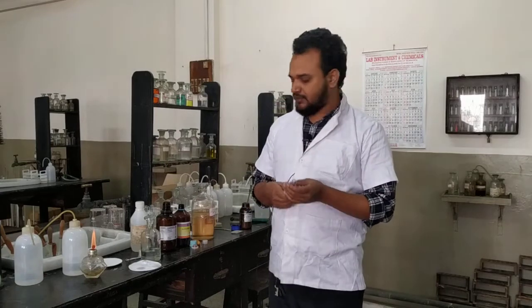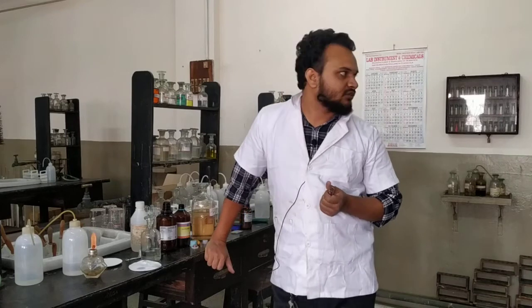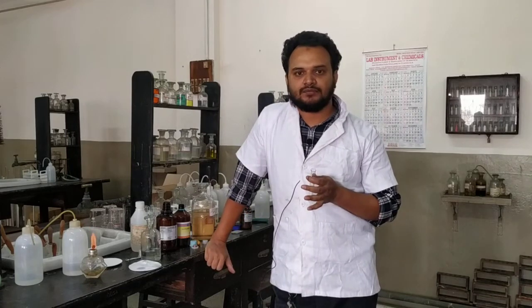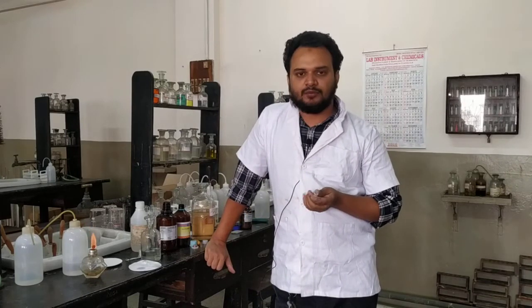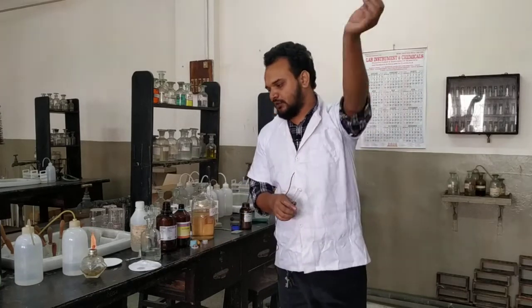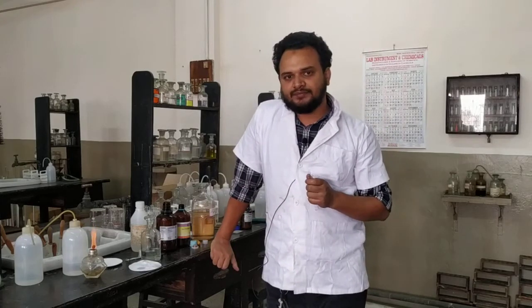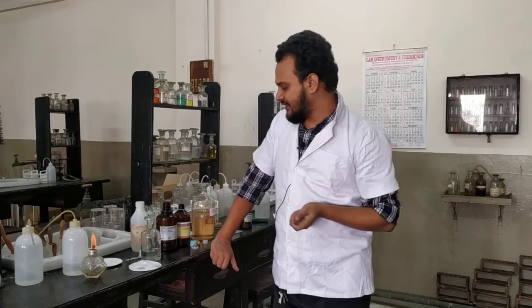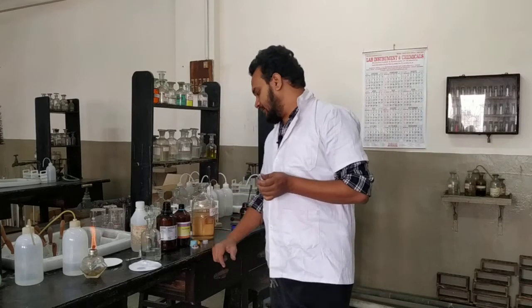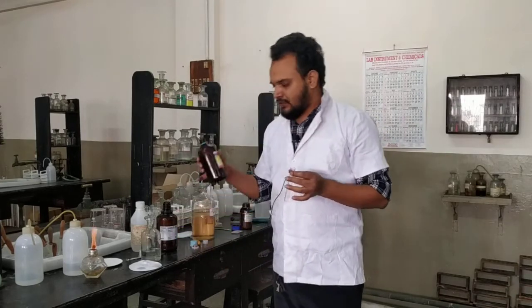Our next test for glycerol is the phenol test. We will add some crystals of phenol to glycerol, then some drops of H₂SO₄, warm it, and then dilute it with ammonium hydroxide solution. A red color will appear. Do this test carefully because we will be dealing with concentrated H₂SO₄.